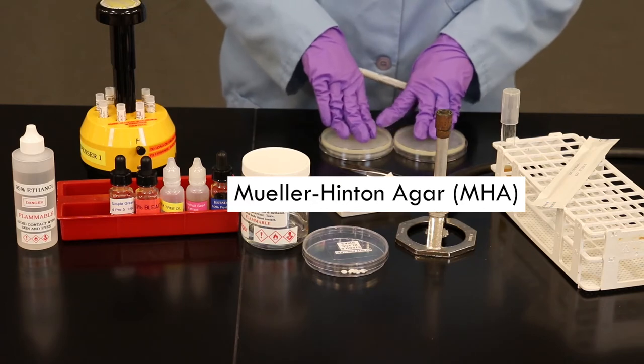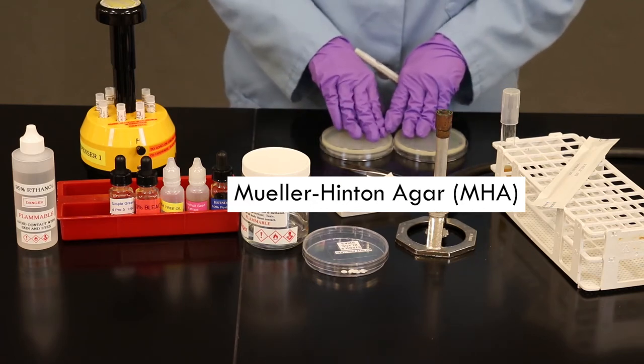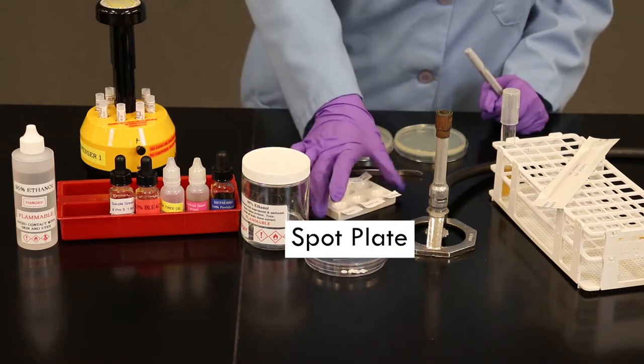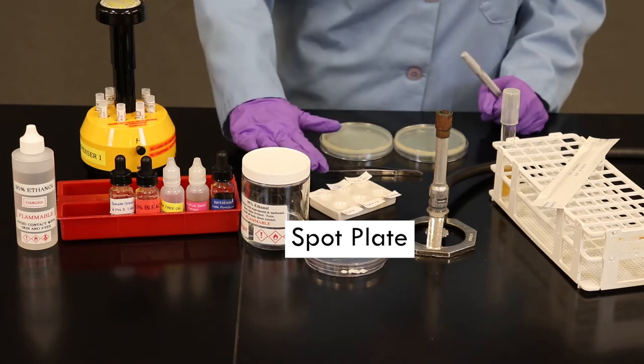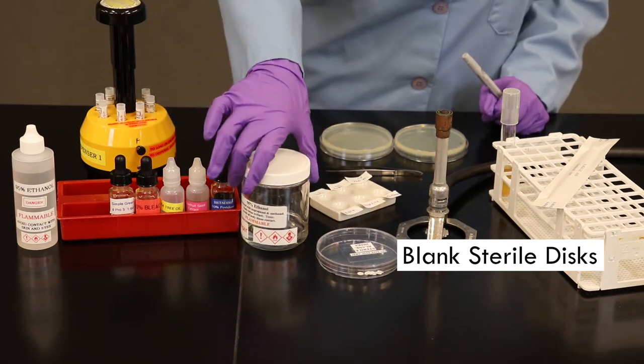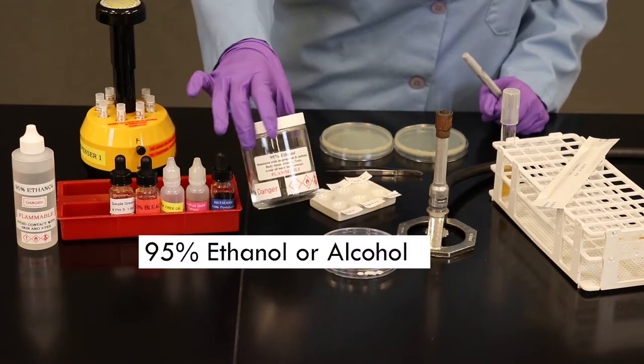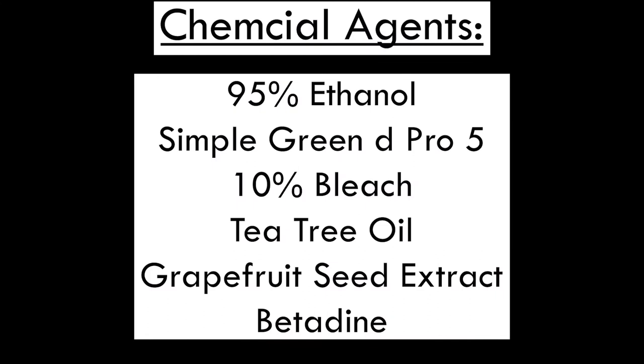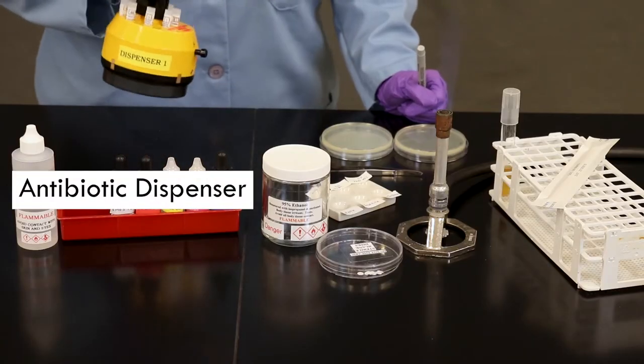We're going to learn about these in the lab manual and what this particular media does for this lab. Forceps for sterilizing, a ceramic dish that we're going to apply different chemical agents to, blank sterile discs to saturate with the chemical agents, a bottle of alcohol here for flaming our forceps, the chemical agents we wish to test, and this is our handy antibiotic dispenser.